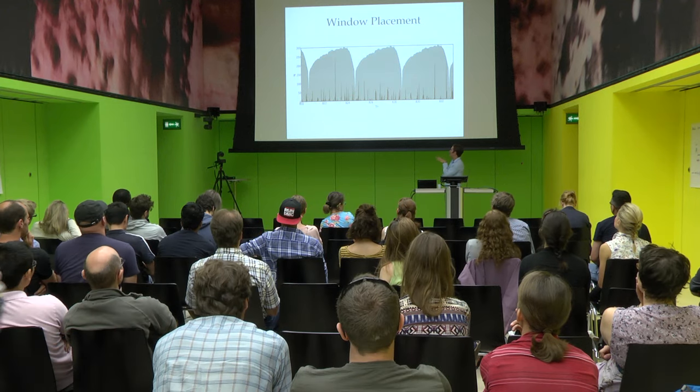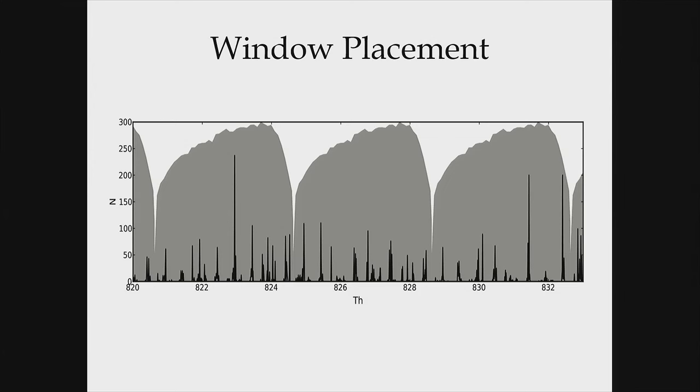So this is the quadrupole transmission. This is showing neighboring 4 mass to charge wide isolation windows. The way I've determined this shape is I only determined it once, so this is the same shape copy pasted left and to the right. But the way you can do it, and I think this happens in some of the Thermo calibration routines, to measure this yourself is to just run like CalMix, so just shoot in an ion of a particular mass to charge, it can be like angiotensin, whatever you want, and then define a 4 mass to charge wide window and just slide it over your analyte.